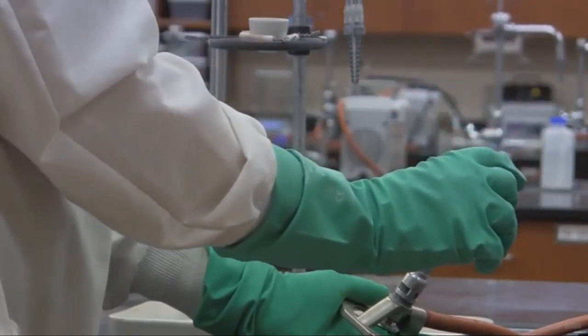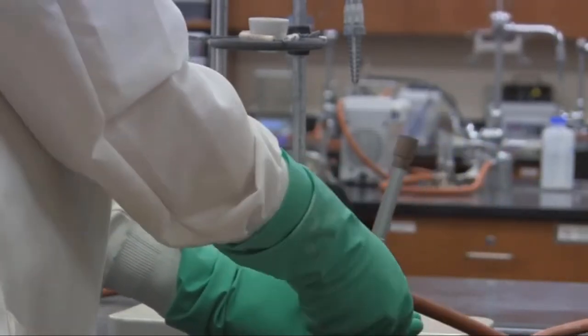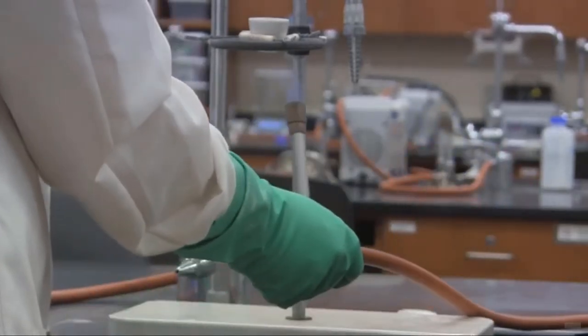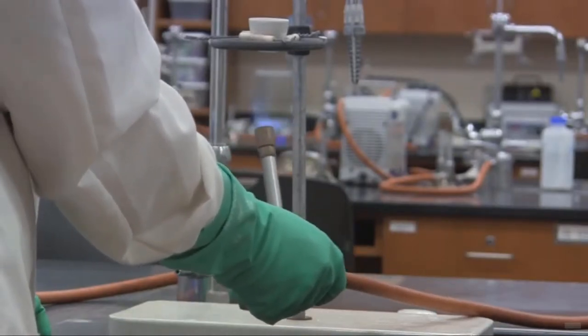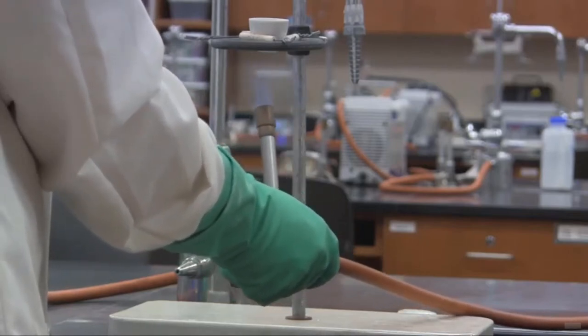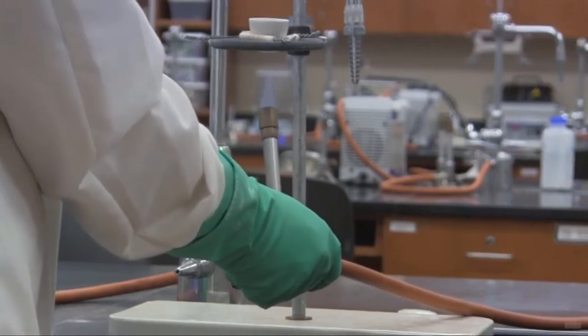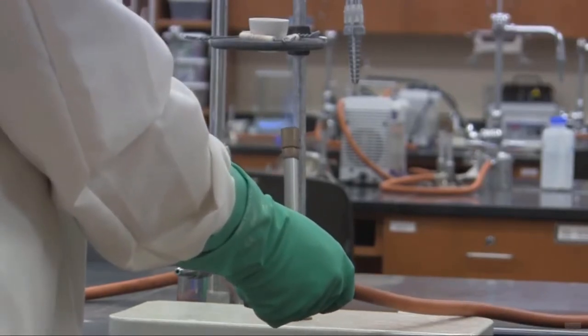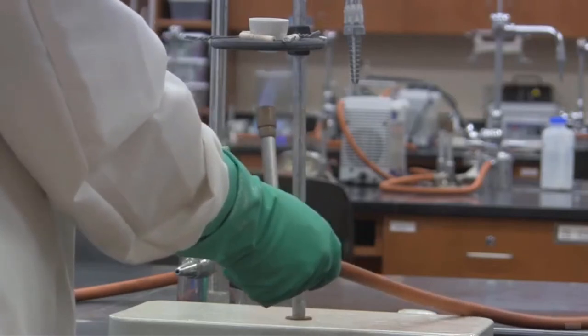And what we're going to do is we're going to take this flame and we're going to gently run underneath here. Now we don't want it completely on the flame. It's about four inches away. And I'm just going to continually do this. We do not want to overheat this because what can happen is that the copper chloride hydrate can turn into copper oxide. And that's not what we want.